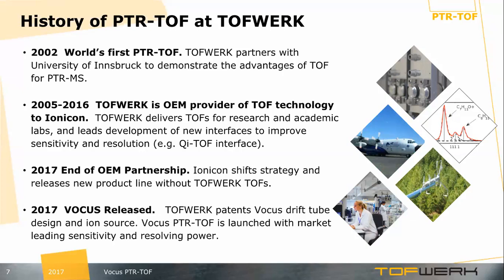In 2017, very recently, this partnership came to an end when Ionicon released a new product line without Tofwerk TOFs. Shortly thereafter, Tofwerk patented the Vocus ion source and reactor, and launched the Vocus PTR-TOF with its product line of time-of-flight analyzers.